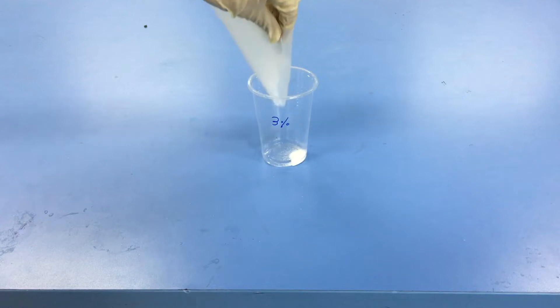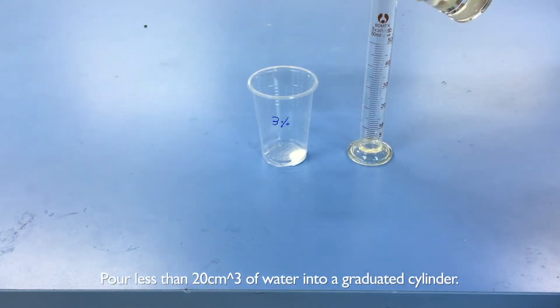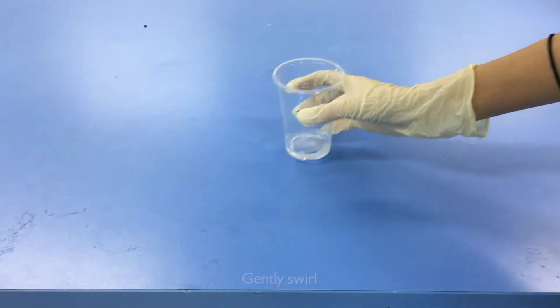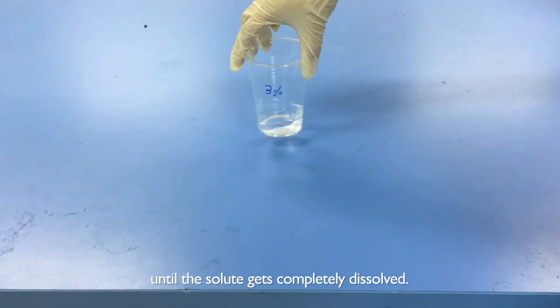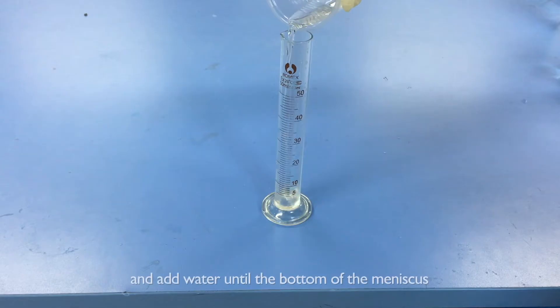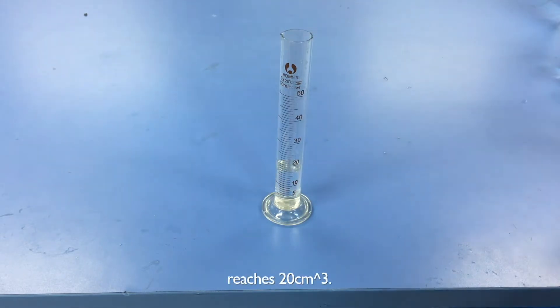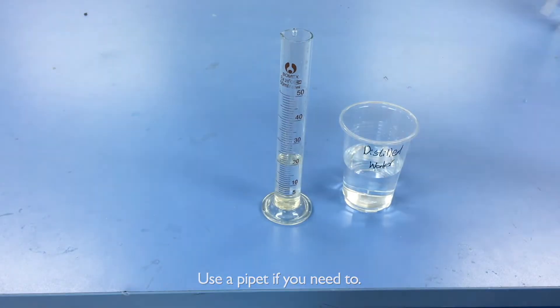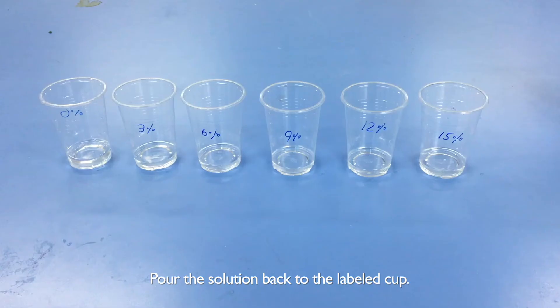Pour the sucrose into the labeled cup. Pour less than 20 cubic centimeters of water into a graduated cylinder. Gently swirl until the solute gets completely dissolved. Pour the mixture back into the cylinder and add water until the bottom of the meniscus reaches 20 cubic centimeters. Use a pipette if you need to. Pour the solution back to the labeled cup.